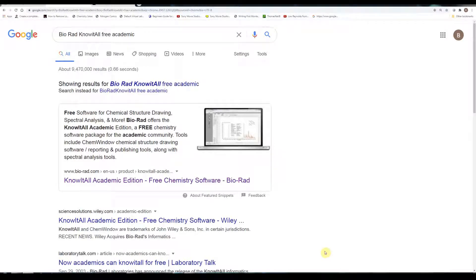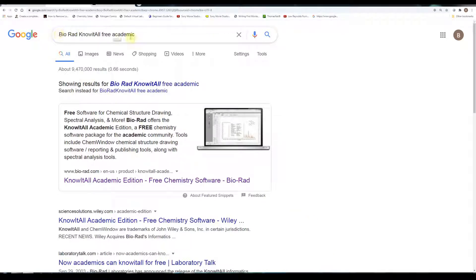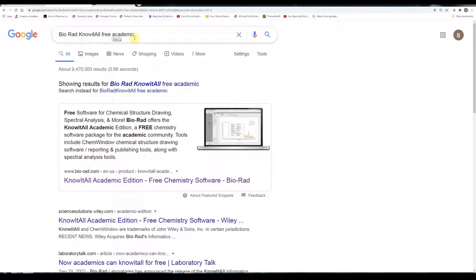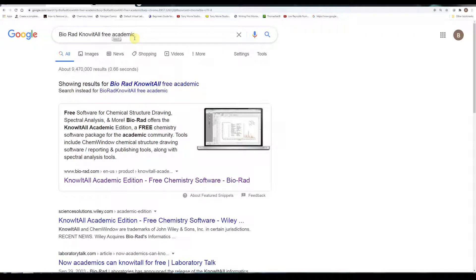In this lesson, I'm going to introduce you to some chemistry drawing software. It's called Bio-Rad Know-It-All. It's free to students, that is for students in diploma-granting schools. It's useful for drawing chemical structures, especially in organic chemistry.